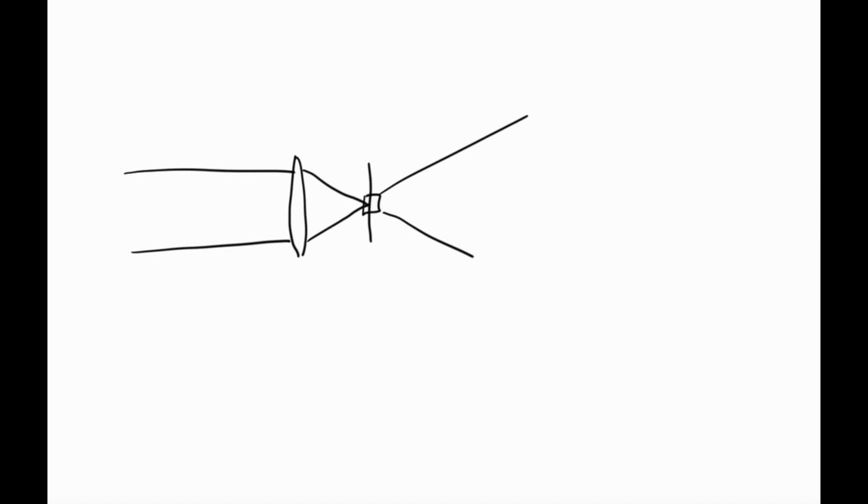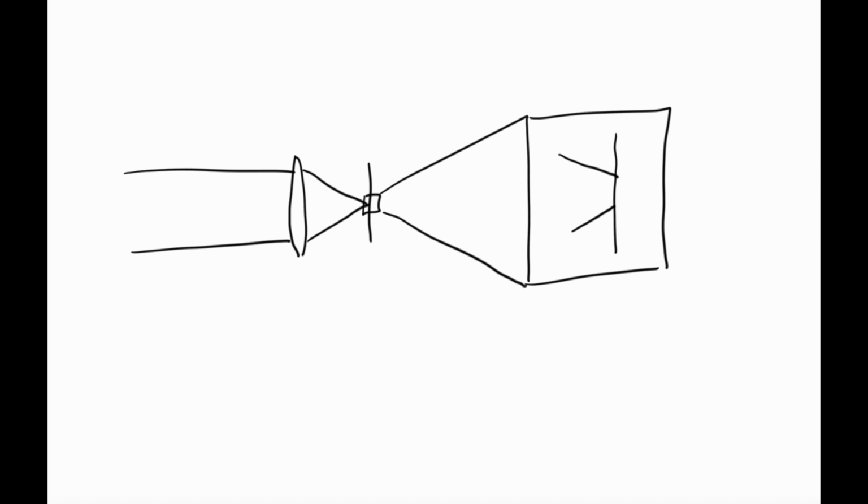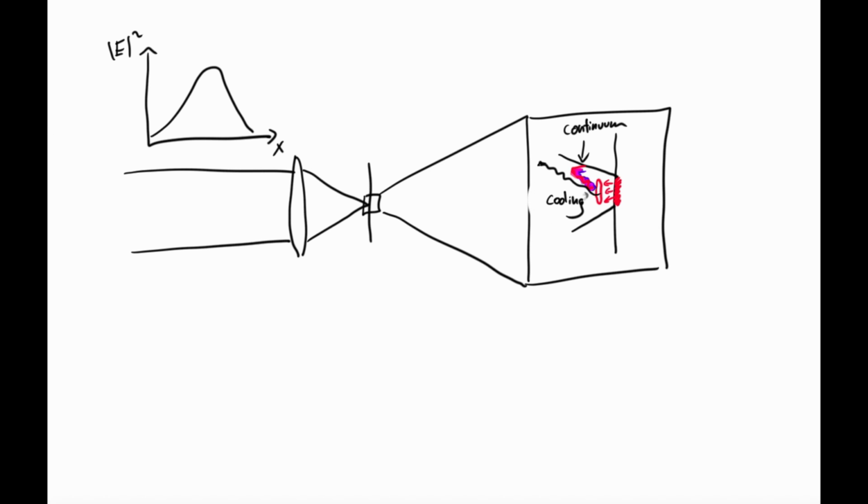For solid materials, a thin slab of the material is ablated. This slab is then further irradiated by trailing a portion of the laser to create a plasma of free electrons, excited atoms, and ions. At first, the plasma emits continuum radiation, but after some time the plasma begins cooling, which causes characteristic emission lines. It is important to time gate the detector to only observe the emission lines.